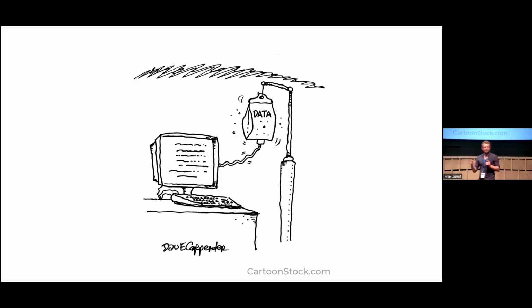So if you have the best tool, meaning MaxQuant, Perseus, and all the other stuff we're talking about here, it doesn't help you if the data just does not contain the information that you're looking for. So you have to be careful when you do your experimental design. You have to be very careful, of course, when you do your sample preparation. But there's also another part where you can use software on the acquisition side.